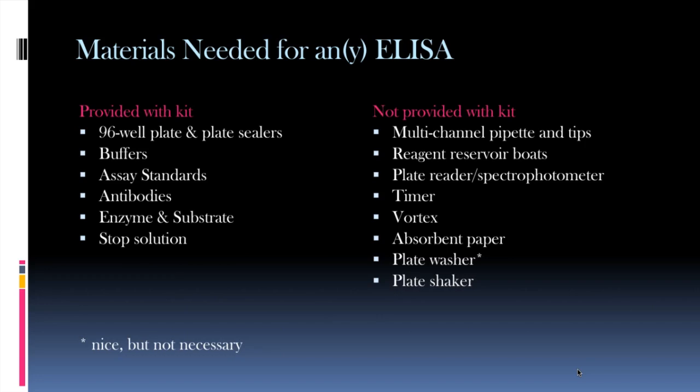A plate washer is a fancy piece of equipment that can be used to do all your wash steps for you. We'll talk about wash steps a little later, but it's not absolutely necessary. You can do the washes manually pretty effectively.